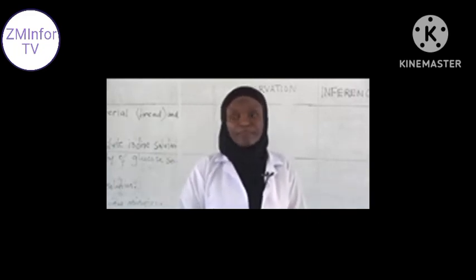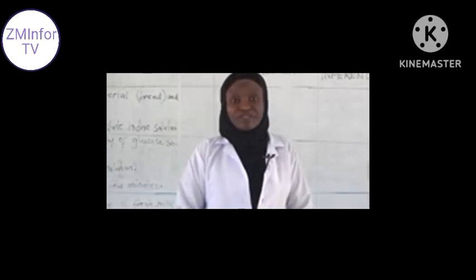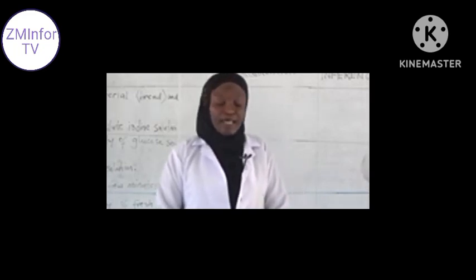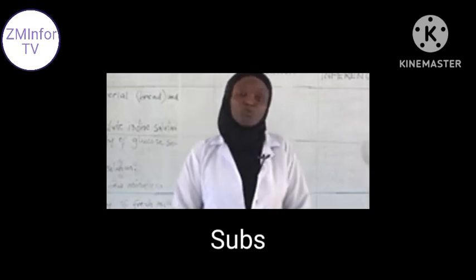Hey students, practical is very important in biology. It guides and prepares the student towards understanding the subject of biology. Practical is very essential in the field and also in the laboratory. Now, if you have to go through practical in biology, there are certain tips that you are supposed to know.